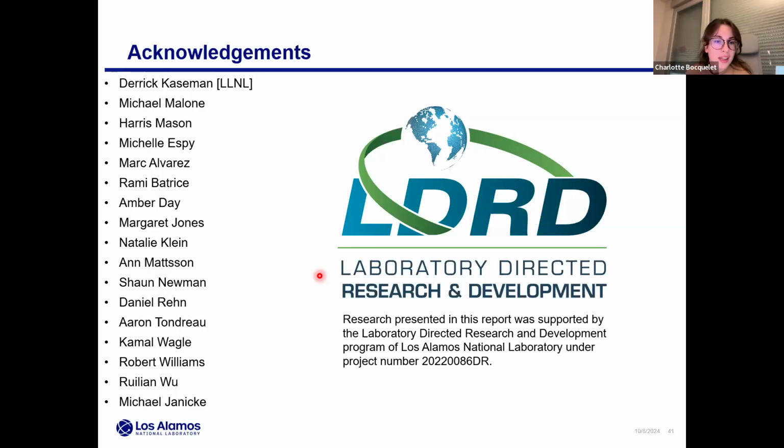Okay. Blake has a question for you. How long does the low field ramp relaxation spectra take to acquire? The field cycling, I suppose.